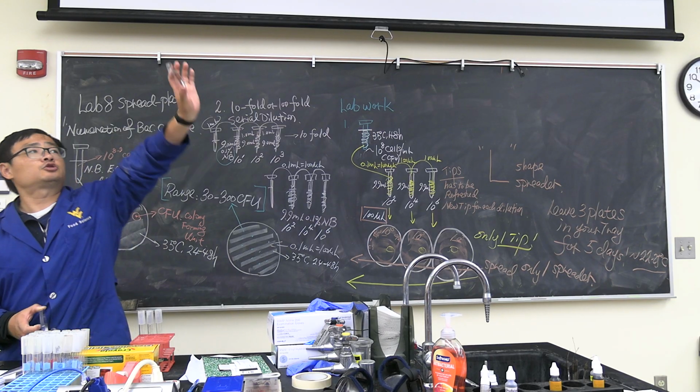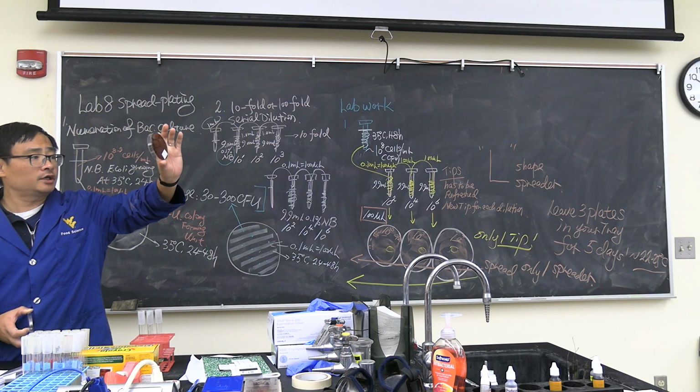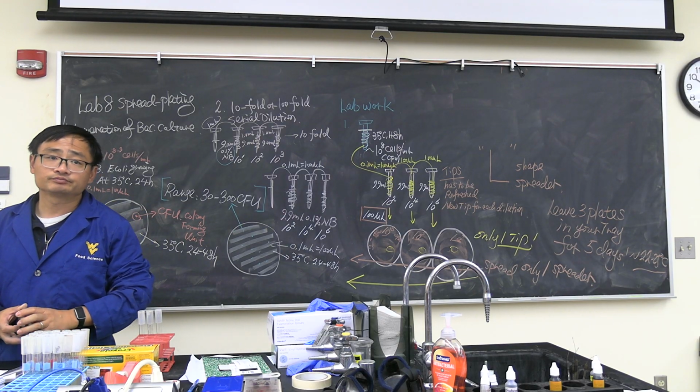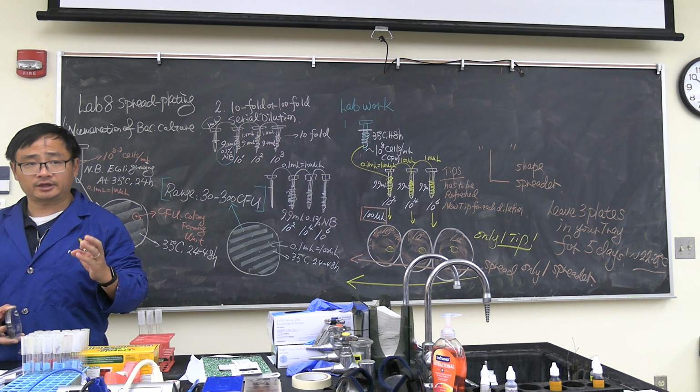Then you can take out your blood agar like this to see the hemolytic. I don't see anything special from my sample. So it should be gamma hemolytic. Sometimes E. coli maybe show a light beta hemolytic.